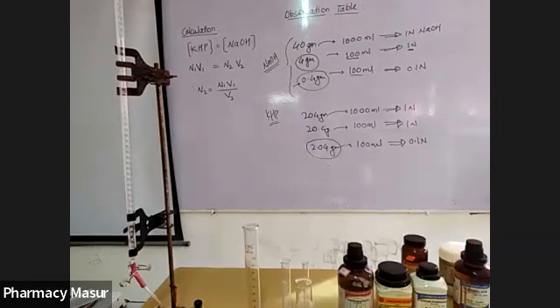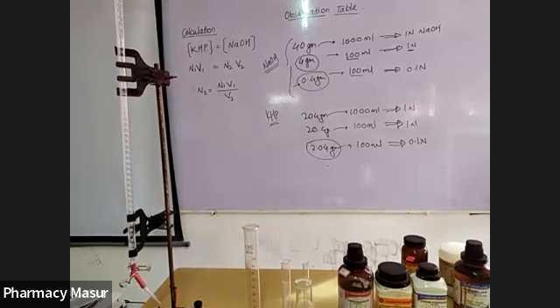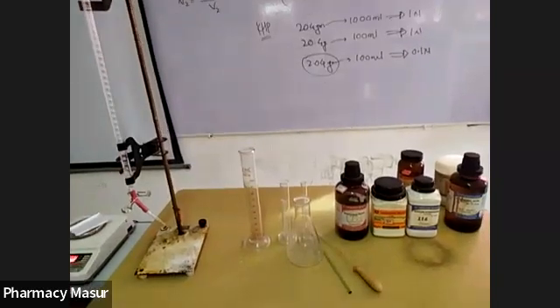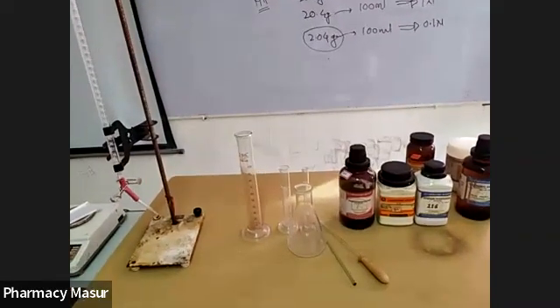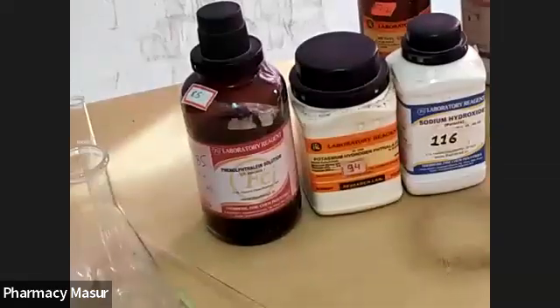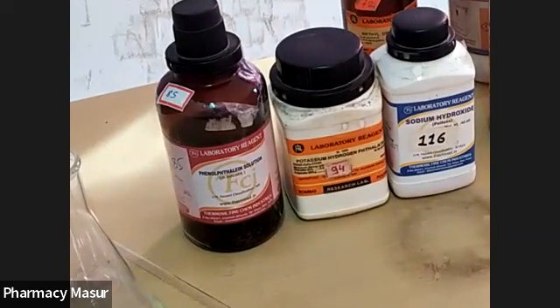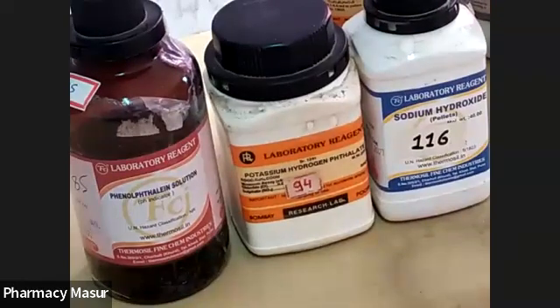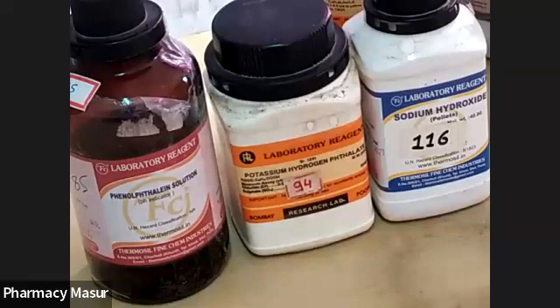The objective is to standardize a sodium hydroxide solution using potassium hydrogen phthalate (KHP). For this purpose, we are using sodium hydroxide (NaOH) in the form of pellets, and potassium hydrogen phthalate, which has a molecular weight of approximately 204.